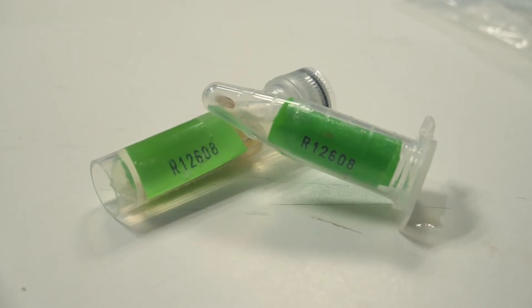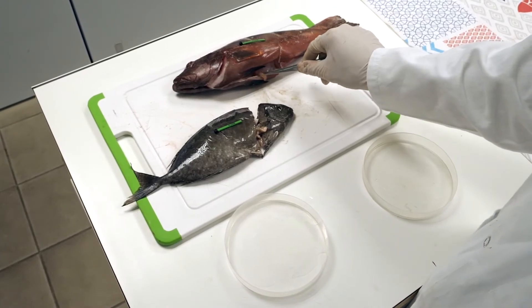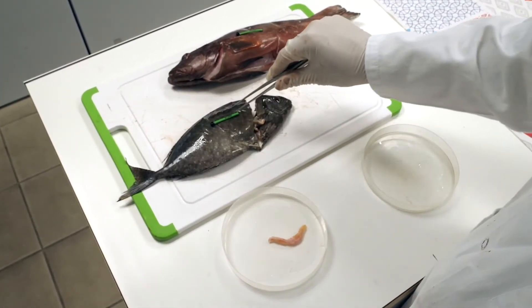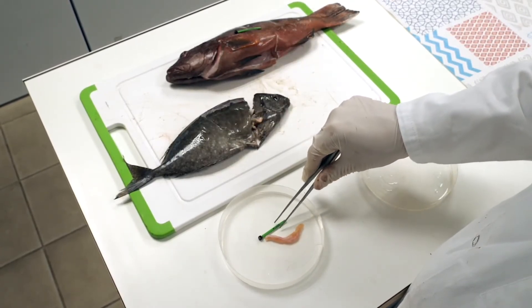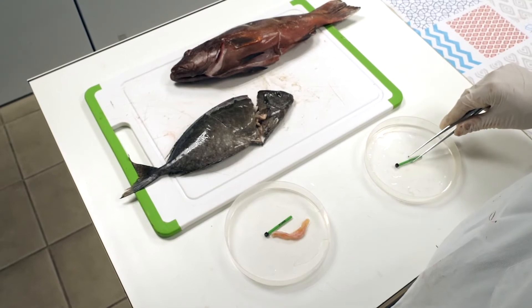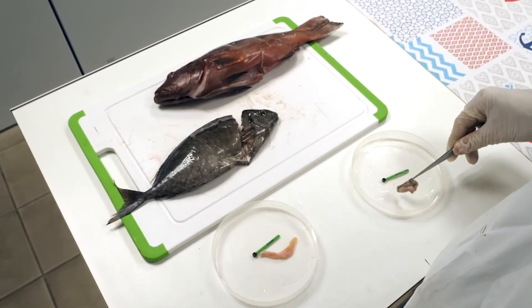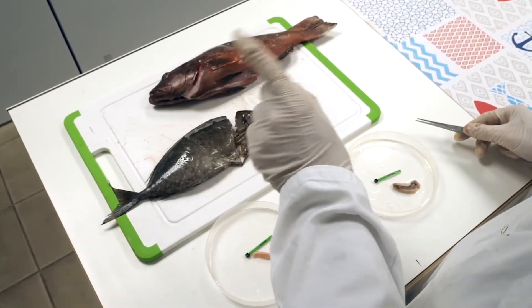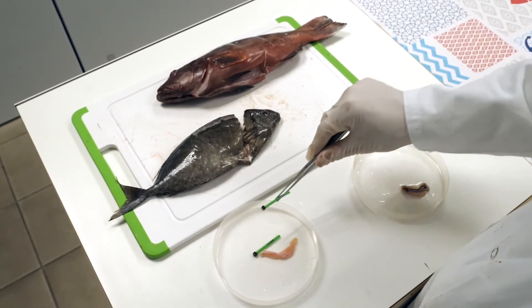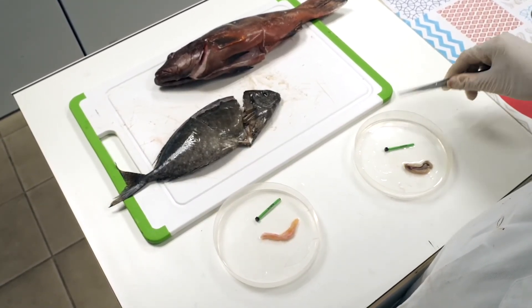It is very important to take great care in assigning identification tags. If a sample is identified incorrectly, it will be assigned to another fish. The sample will then be associated with a fish of a different size, species, and weight than its actual source. When this information is entered into your database, the incorrectly tagged sample will lead to errors in the analysis, and there will be no way to know that this has happened. This can bias the results of your study.